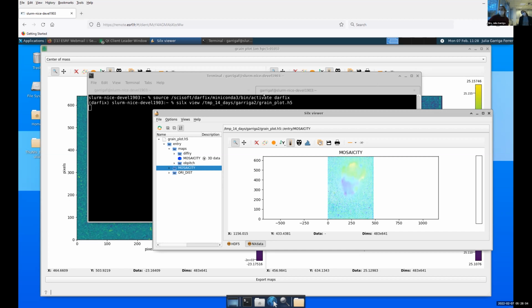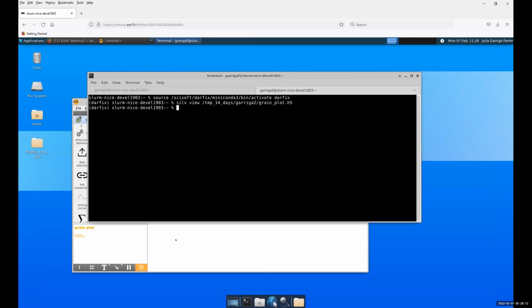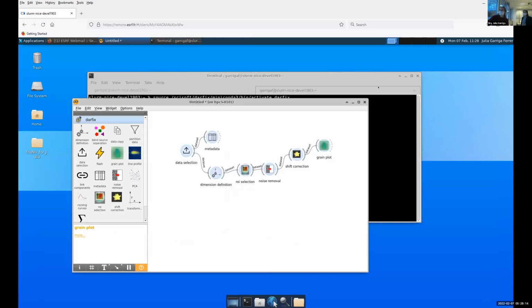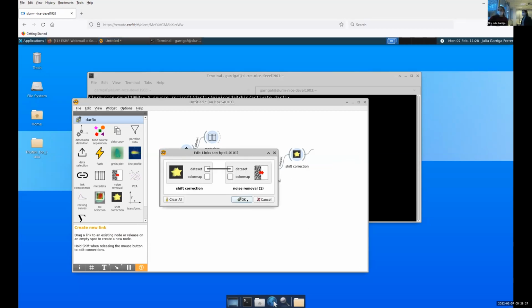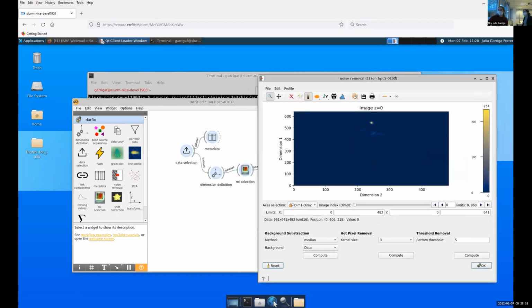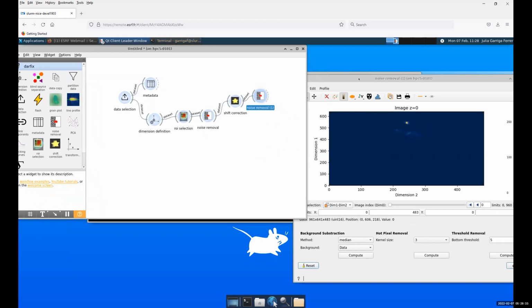Okay. So while we wait for Peter to finish with the ROI, we will go back to our workflow. Show me the workflow, please. Yes, I'm going there. So this is the workflow. ROI now. And after the shift correction, we will do another background removal. Exactly. Let Peter see the workflow.